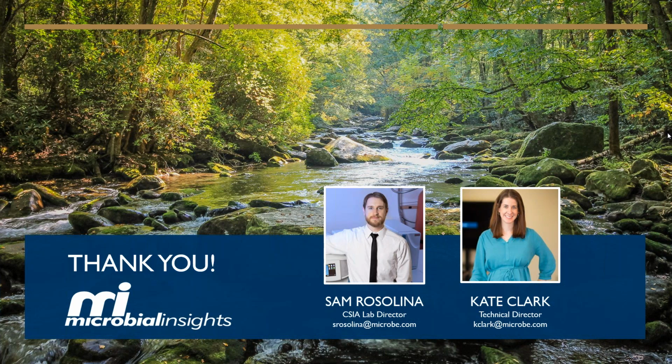That being said, it is exactly as you are thinking. Using isotope analysis is a great way to differentiate different products and where they begin, whether they're natural or synthesized, or whether they are one compound versus another. So that is a great place to start. It's just not something that we currently offer at this time.